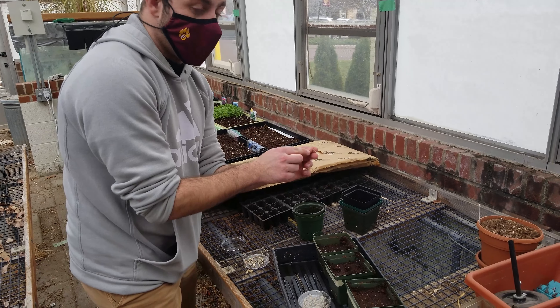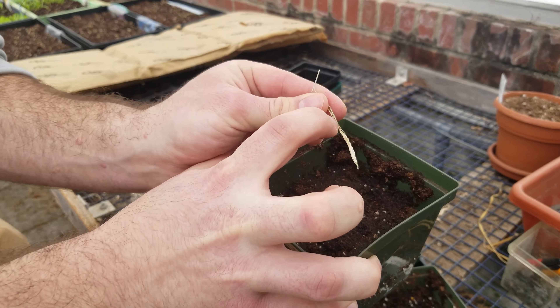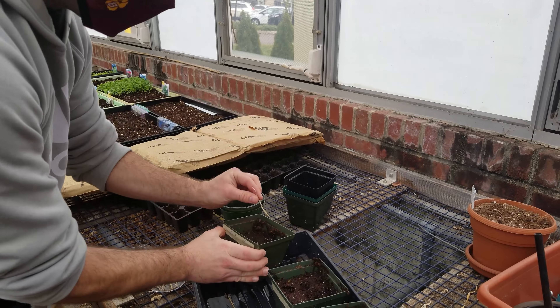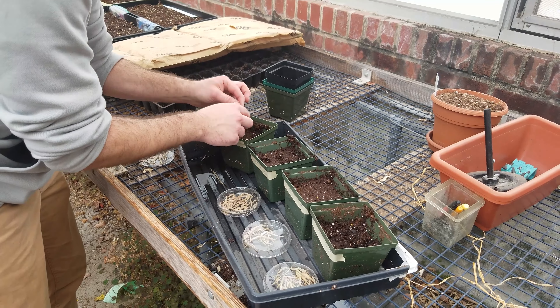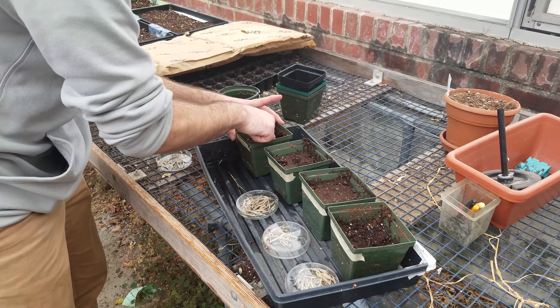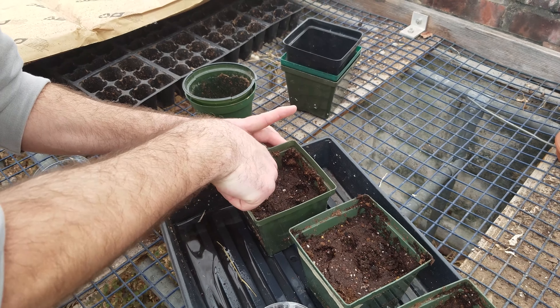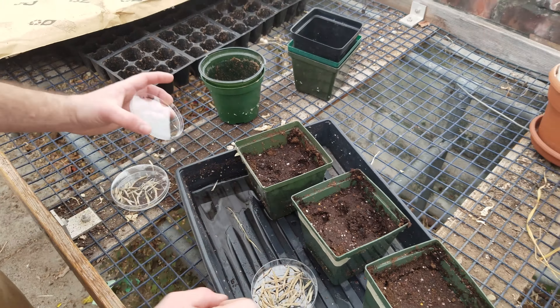I'm going to plant only the seeds, not the pods. If you look here, you have a pod with all those seeds in there, and I have my pot labeled. I'm going to put some of those seeds in there and start pushing them down just a little bit. That one's done; I'll do the same with the next one.